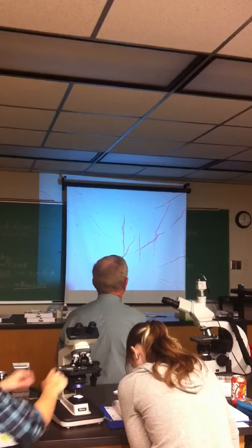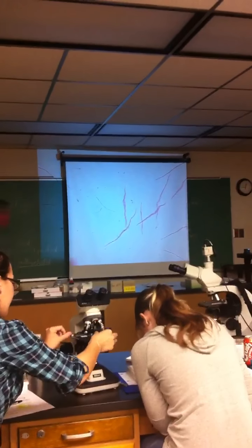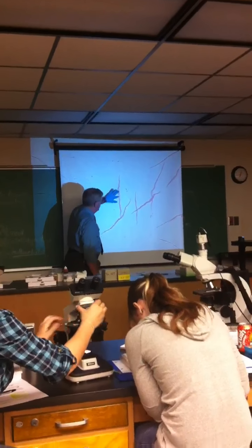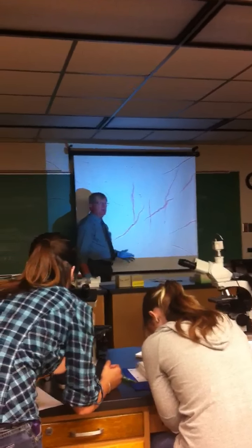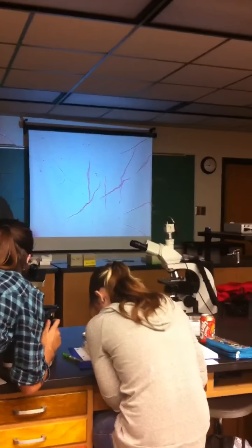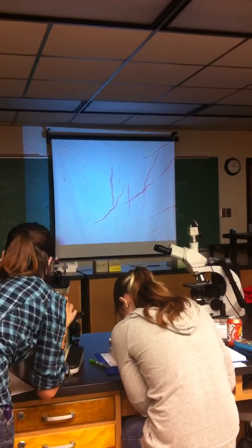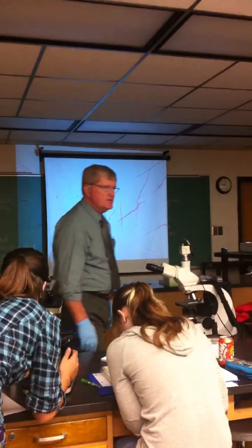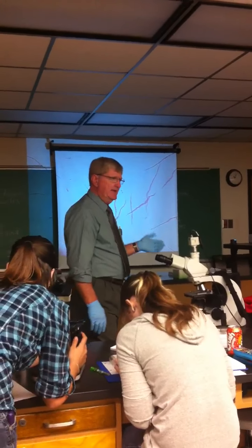All right? And then what do you suppose this is? Why is the middle of this cell, from here to here, thicker there? That's the nucleus. All right? So the shape of the cells alone ought to give you the clue that you need to identify this as smooth muscle tissue. By the way, not all of your slides will look like this.